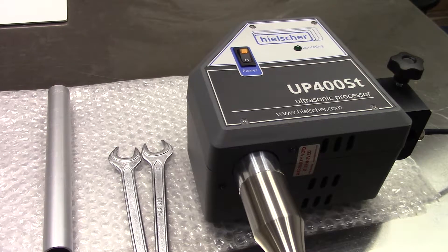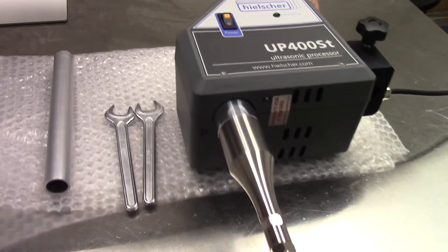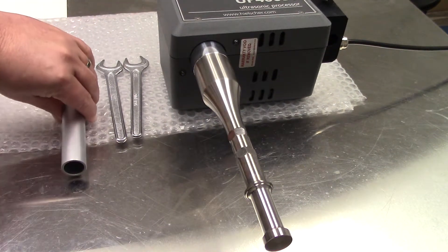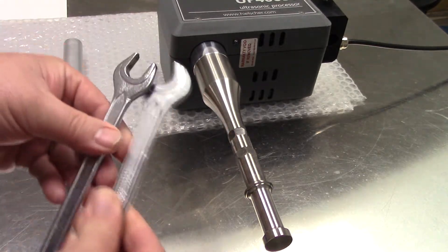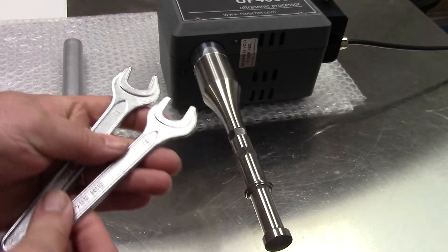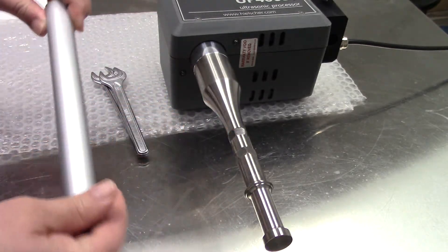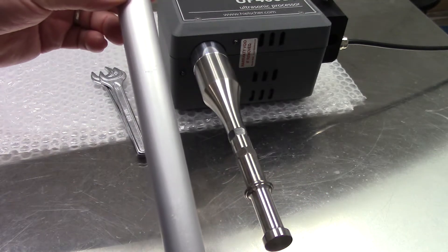Today we'll be dismounting and mounting a sonotrode. Required for this are the two wrenches that came with the unit. A pipe, also called a cheetah bar, can also be used.